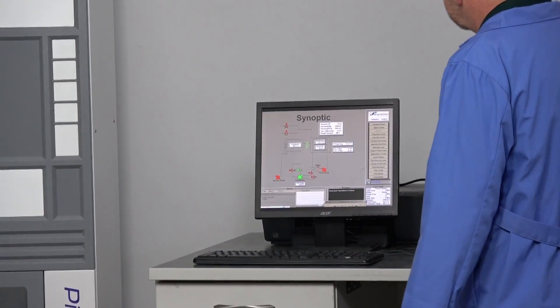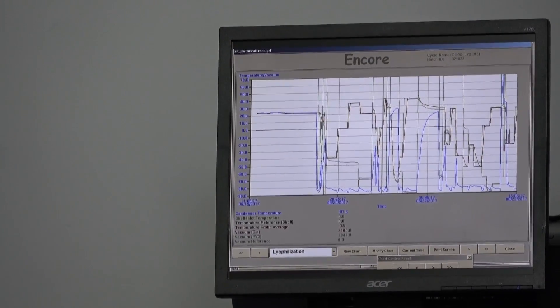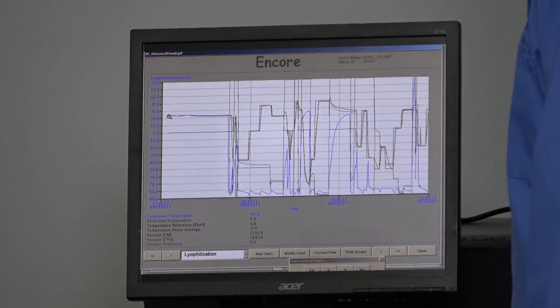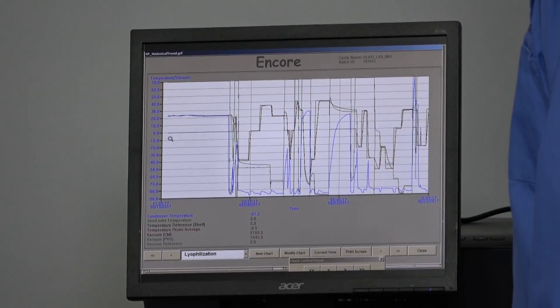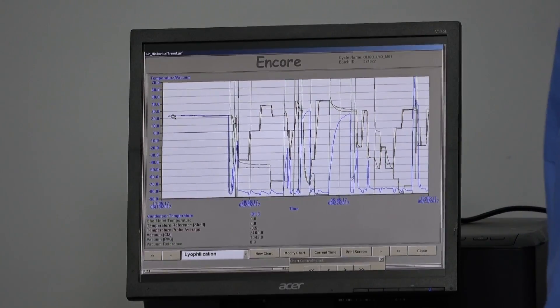The hours are tracked via a historical data record in the software. I pulled up the history of when the machine was installed — right here on this side of the screen you can see where the lines start. That date is June 19th, 2017. The very next day they ran a recipe, tracking vacuum and shelf temperatures, and they ran that recipe for about four days.